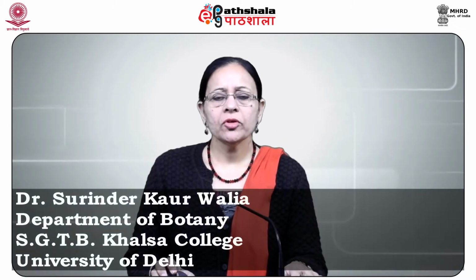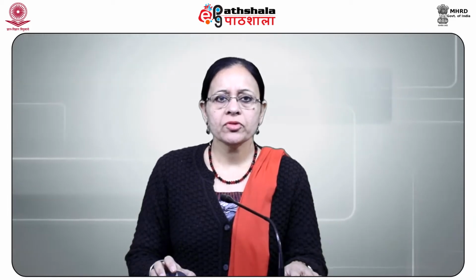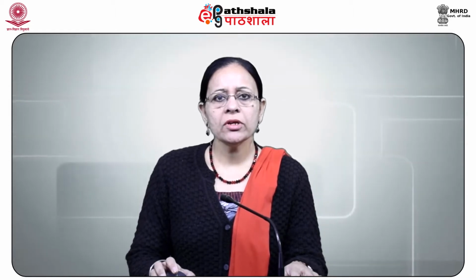After studying this module, you shall be able to know about the DNA extraction procedure, learn the purification process of DNA, and how DNA is fragmented.